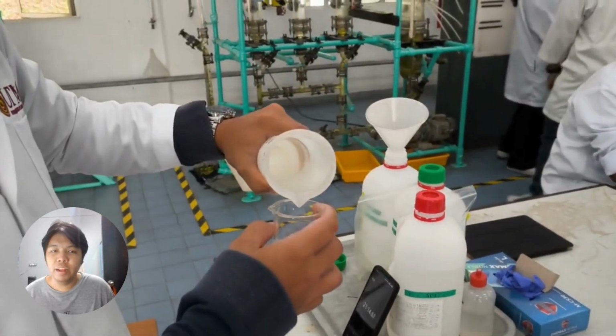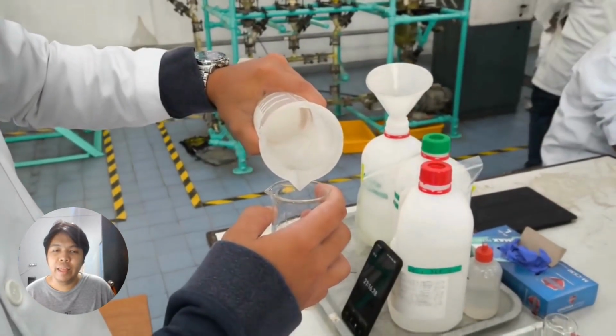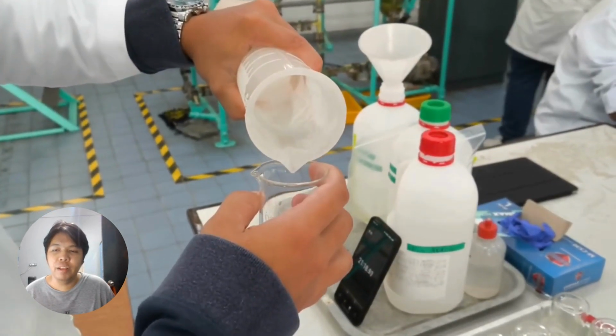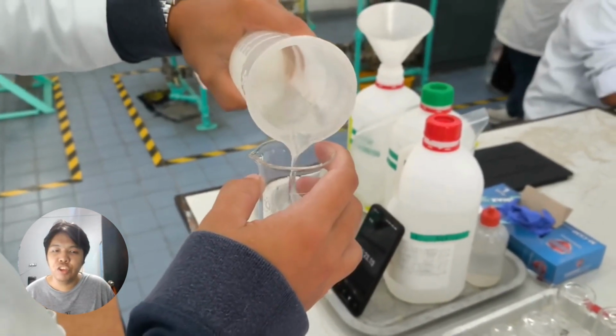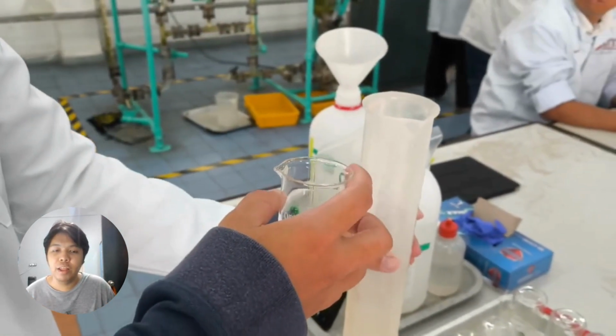The collected distillate product will be used to test its refractive index using a refractometer. This step is crucial to know the composition of acetone in the distillate product.